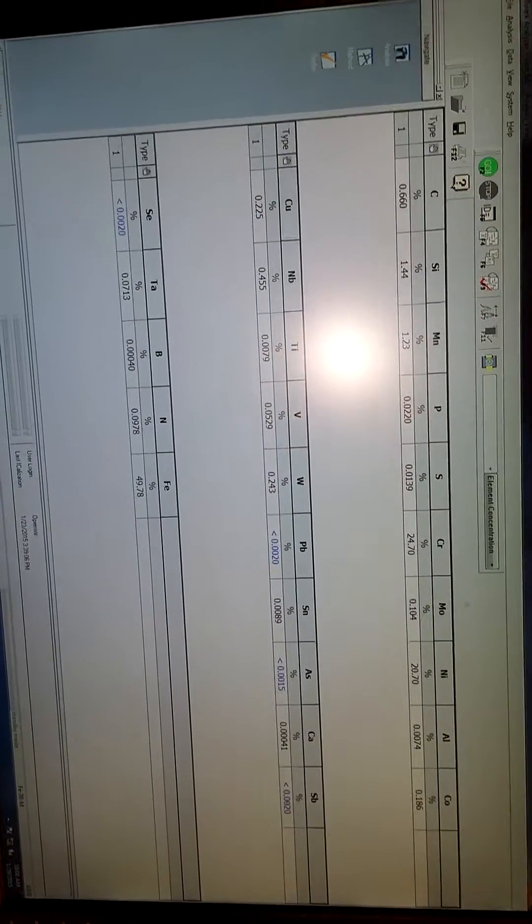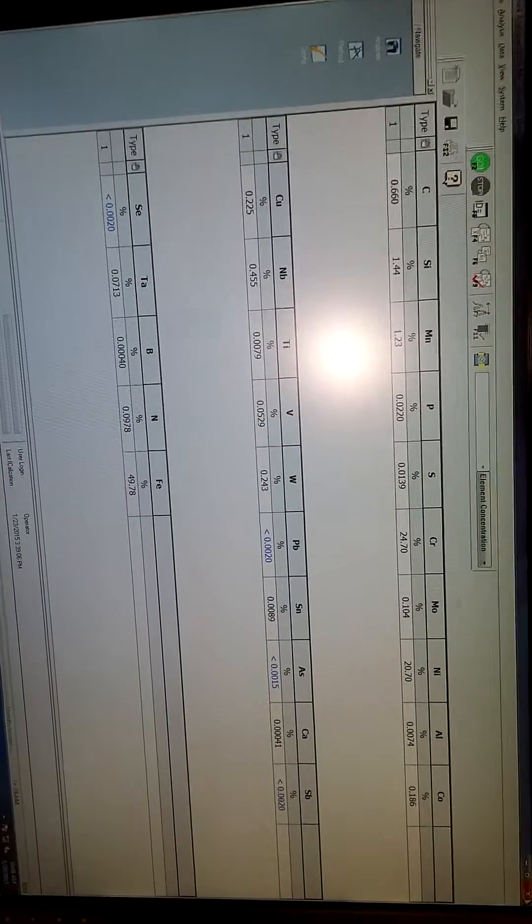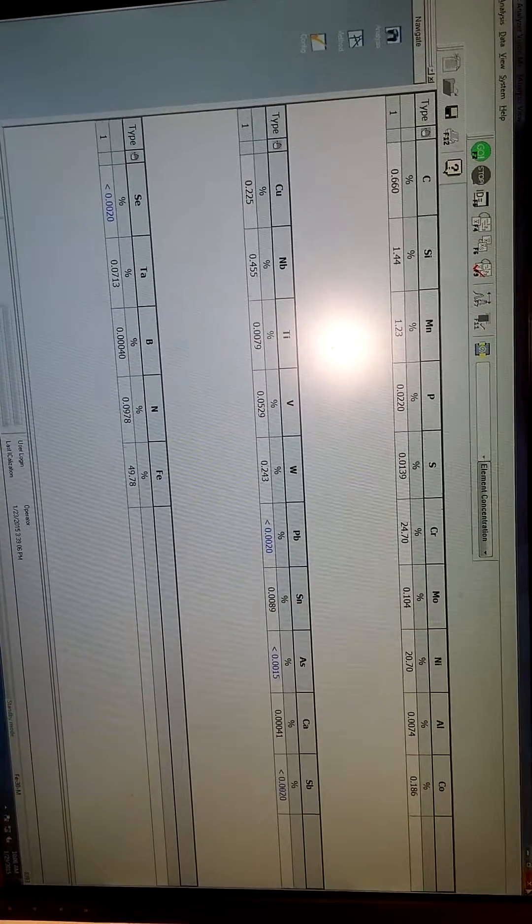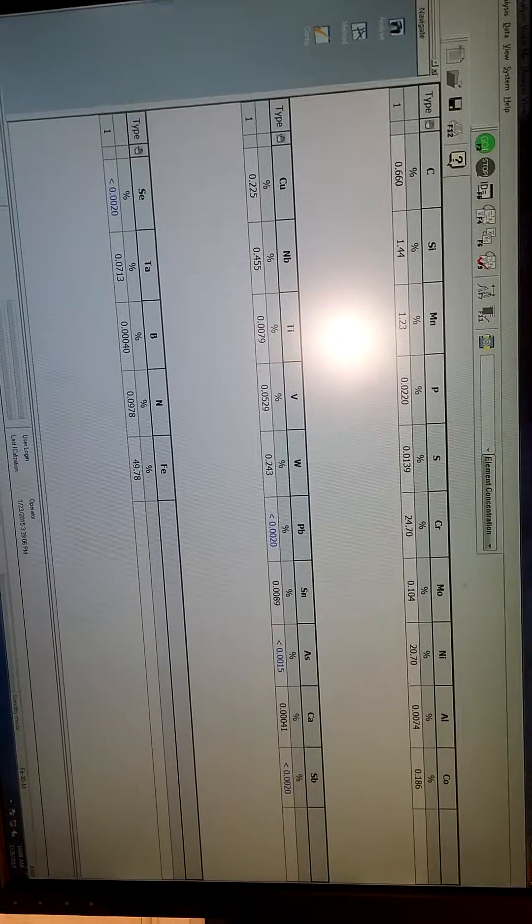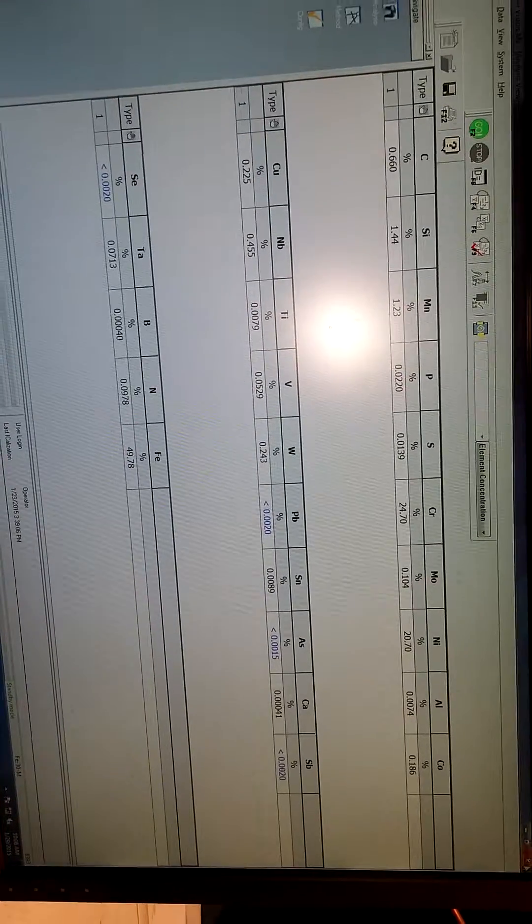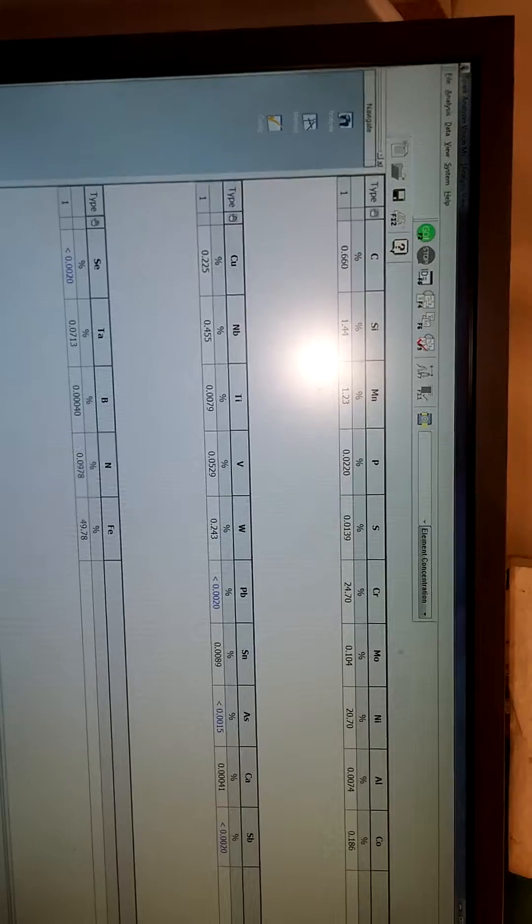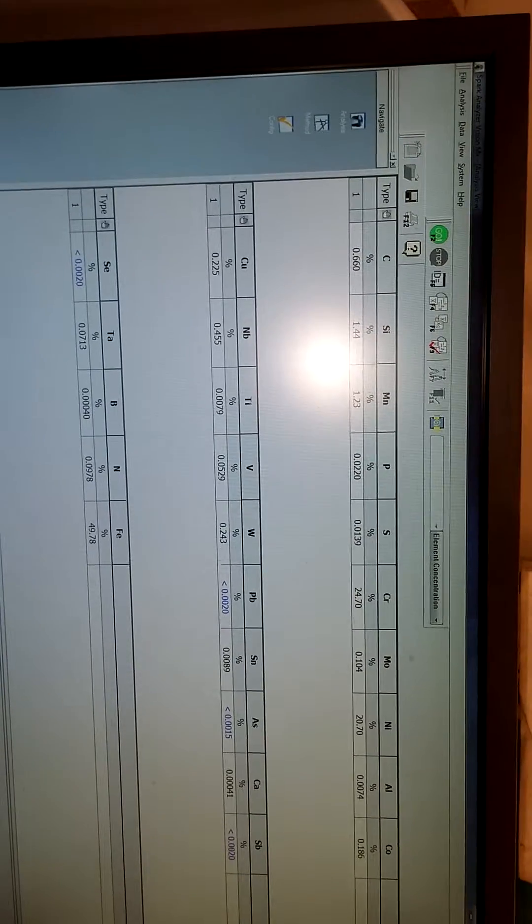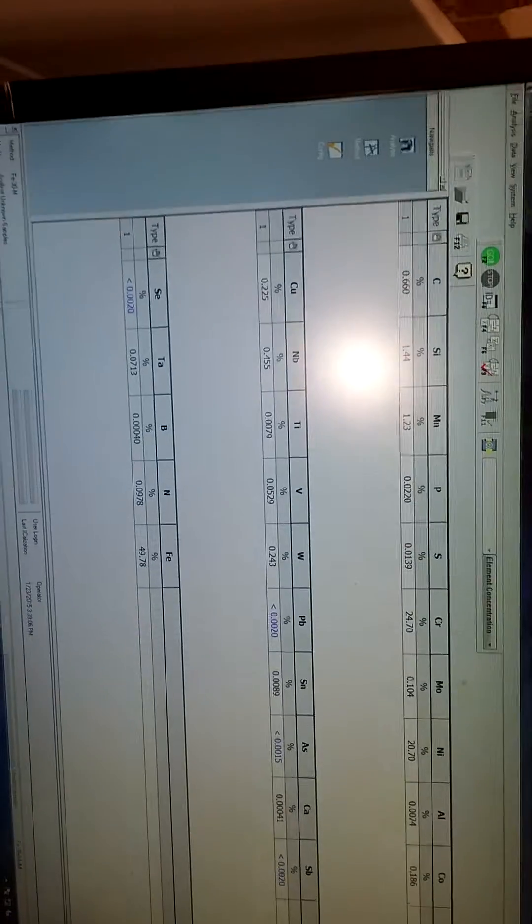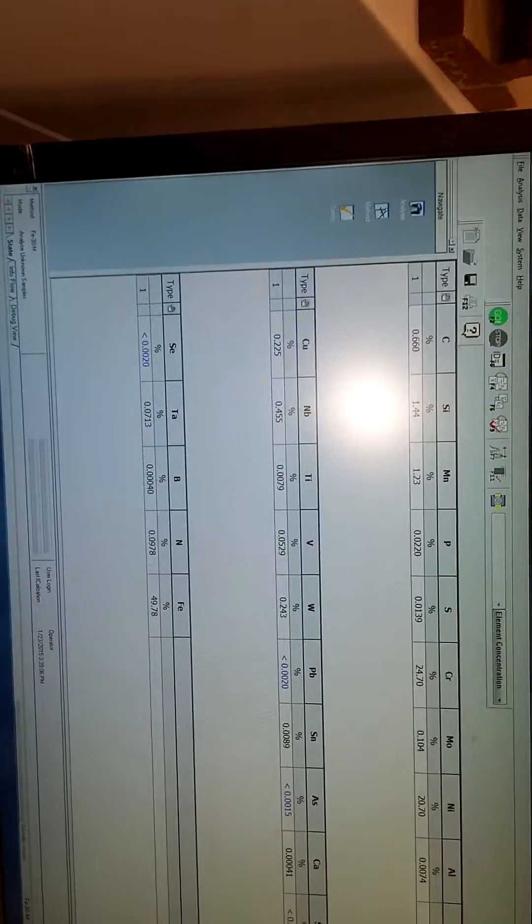So that's all we have to worry about with this metal is carbon, silicon, manganese, chrome and nickel. And everything's good to go. Like I said, we're just processing metal right now so 0.66 carbon isn't that bad. I can still go with it. We can adjust it later on during production.